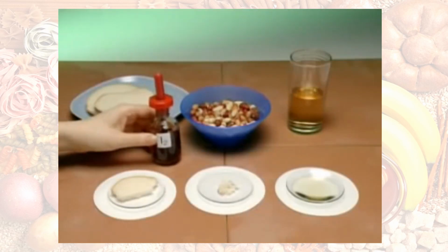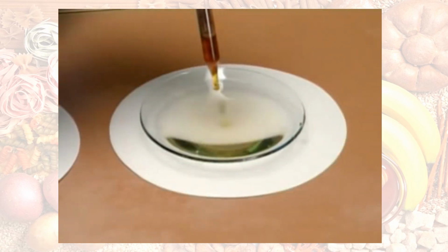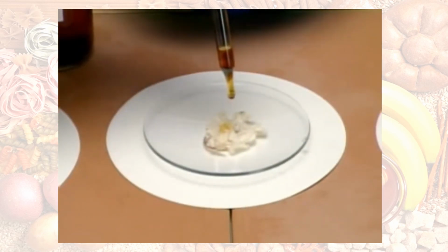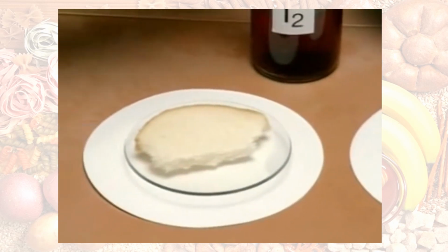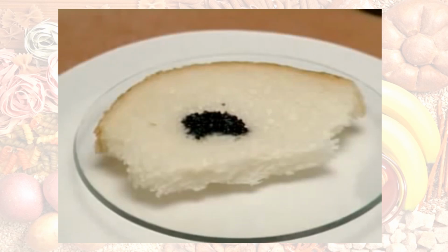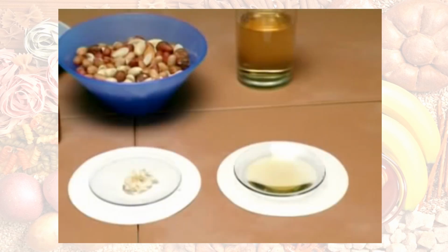So will any of our foods test positive? Grape juice, nuts, or bread. Starch is present in bread, but not in grape juice or nuts. Okay.